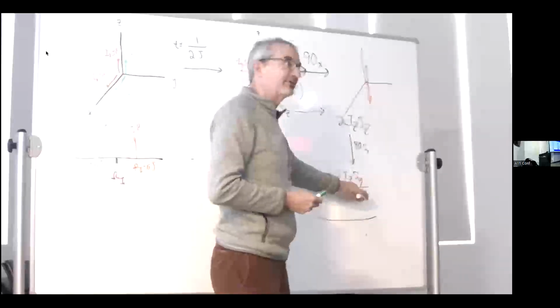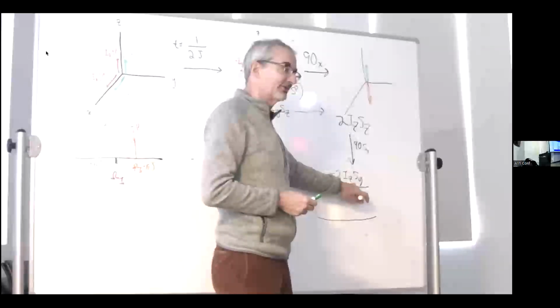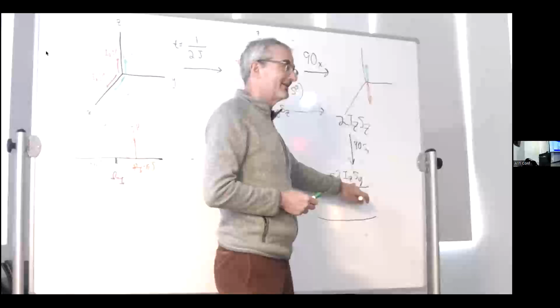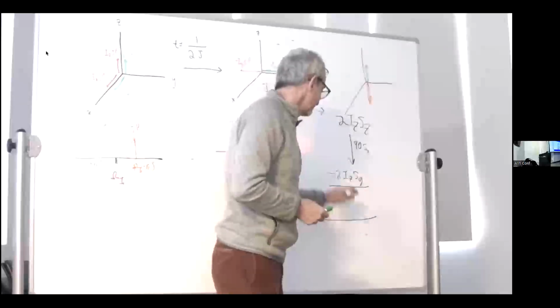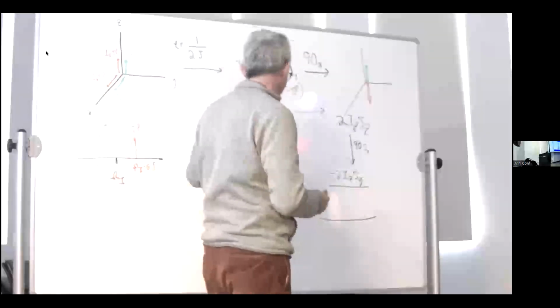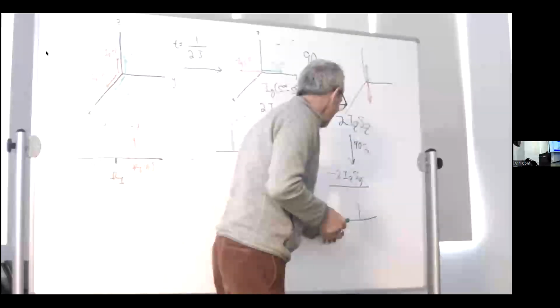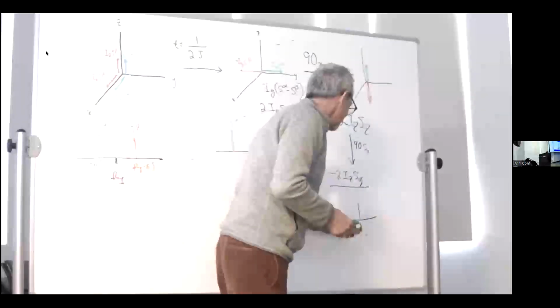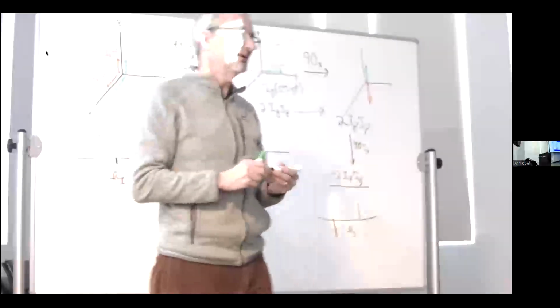The S spin frequency, not the I spin frequency, because the transverse operator is the S spin. So I'm going to see, and because of this minus sign, it will be opposite from what I had before. So it's going to look like this. But the key thing is the antiphase doublet is on the S spin.